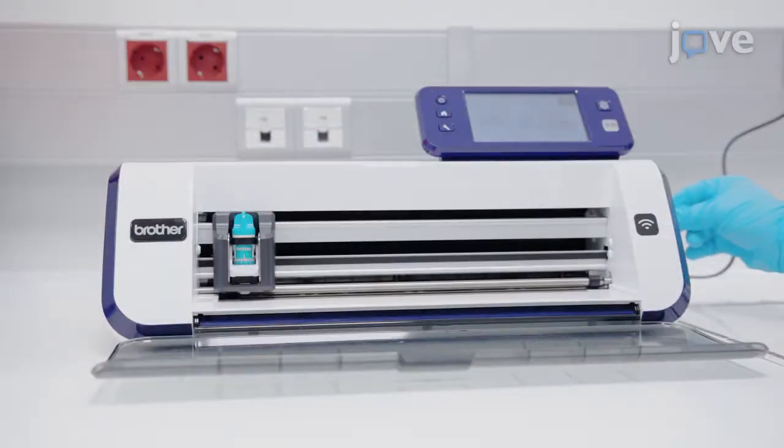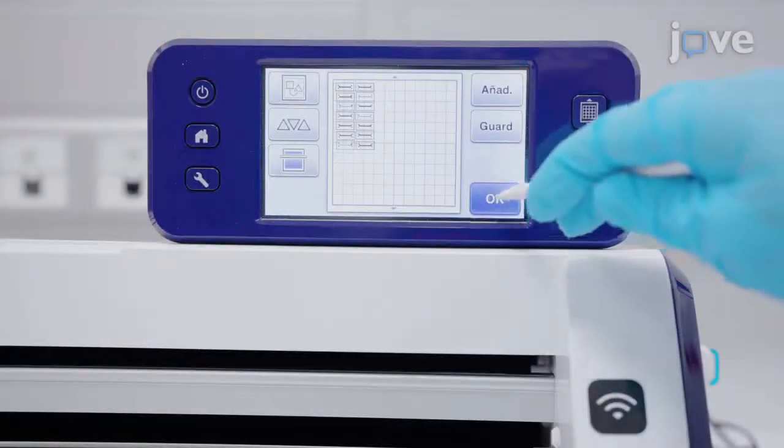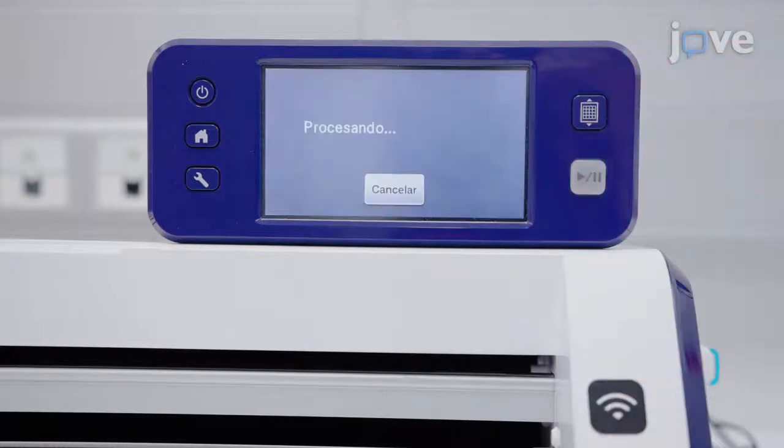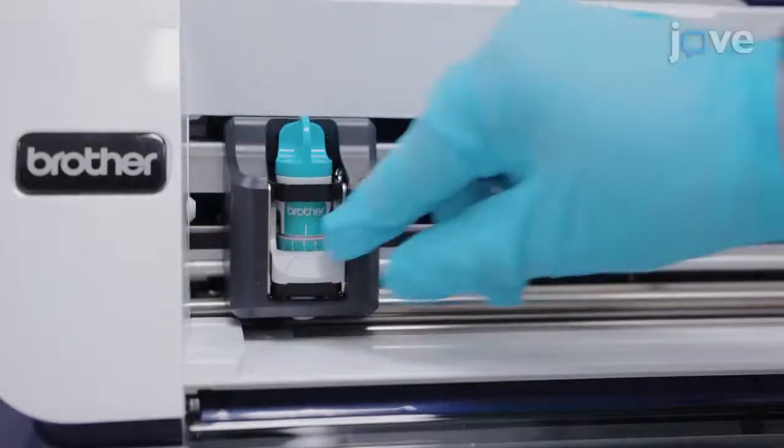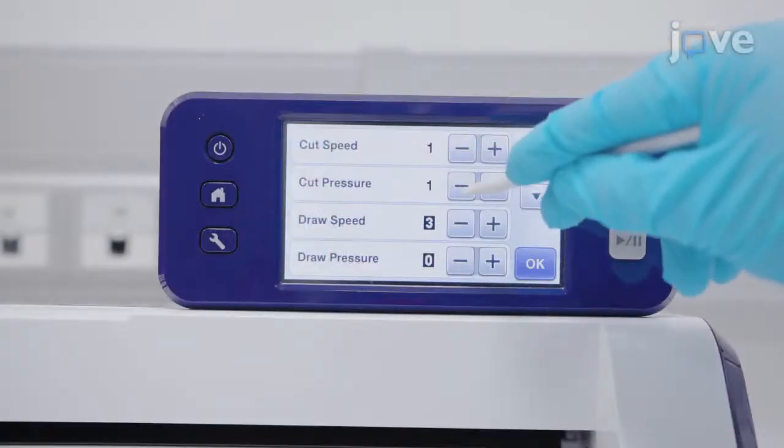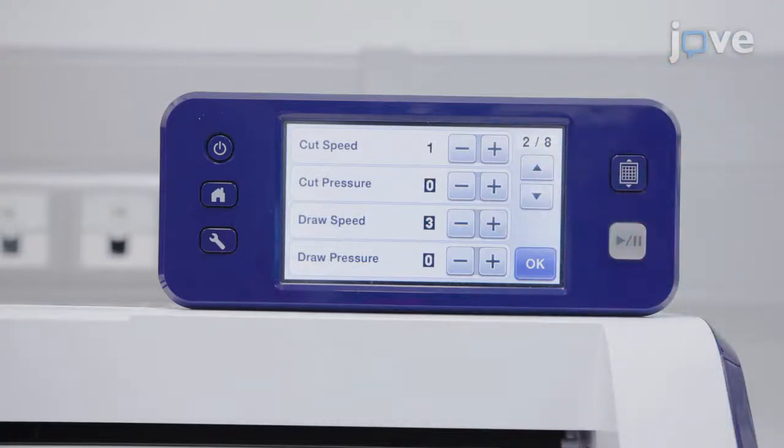Using a USB drive, upload the .svg file to the edge plotter and set the cutting parameters as cutting pressure at level 0, cutting blade at level 3 and level 1 for the cutting speed.